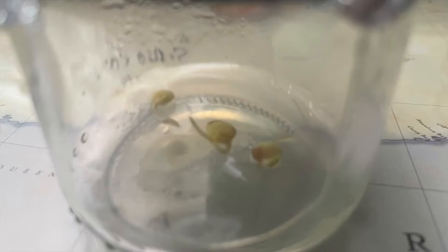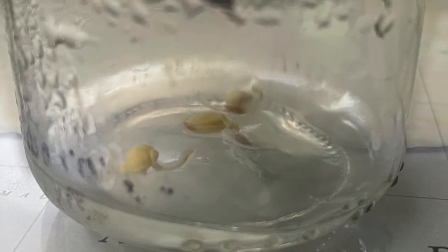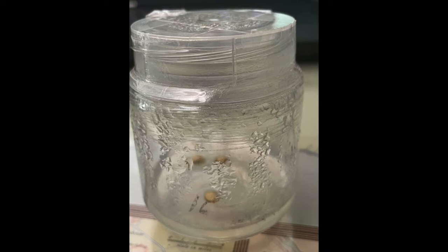During the next 4 days, there was no sign of contamination in the medium or germination. On day 5, they began to show signs of germination in container 3. 9 days after starting the experiment, only container 3 showed positive results. The other 2 did not show contamination, and neither did germination.